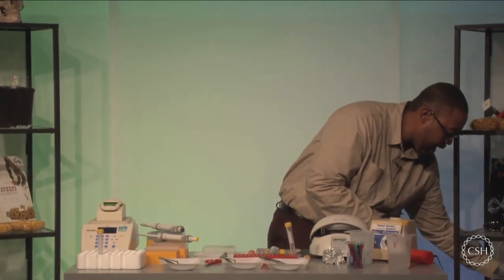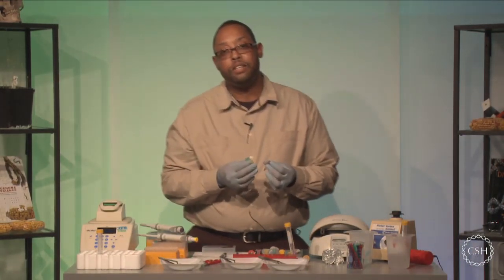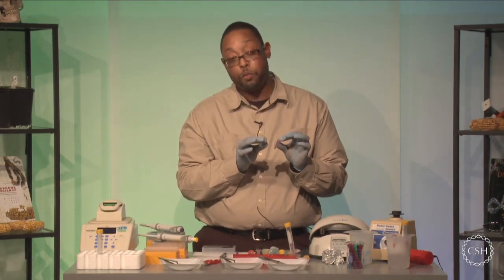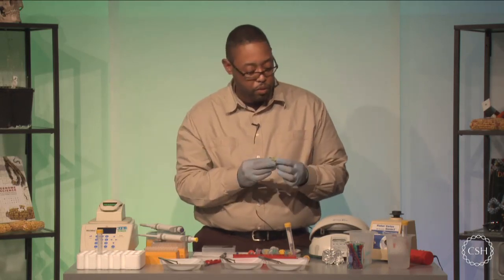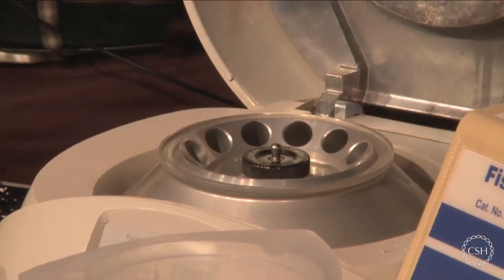Now, obviously, we gave time for the silica resin to bind DNA, but we're going to have to clean the silica resin as well. So we first need to remove the supernatant from the presence of the silica, and then wash the silica resin itself. So let's do the first step, which is actually to get the supernatant away from our silica resin.